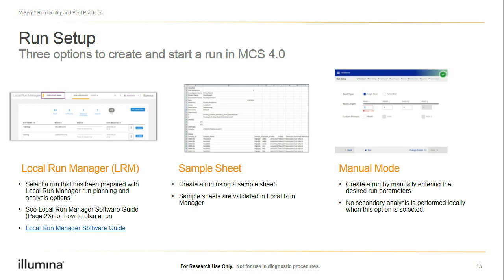To view the Local Run Manager interface on the instrument monitor, open a web browser, which is typically Chromium, and enter https://localhost in the address bar. The appendix of this presentation will also contain a link to relevant resources for Local Run Manager.